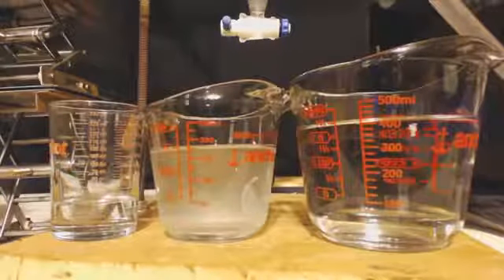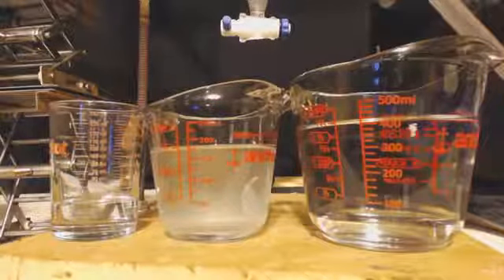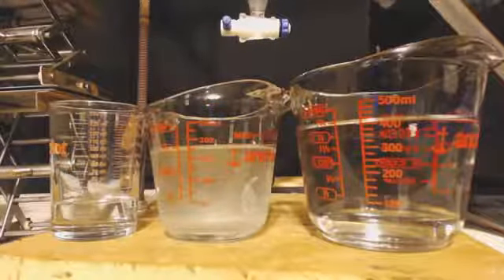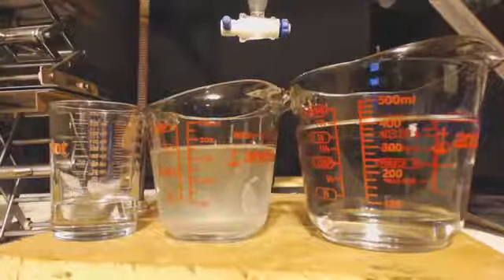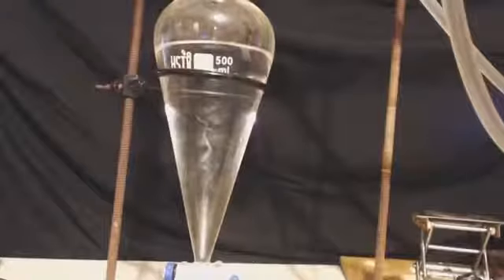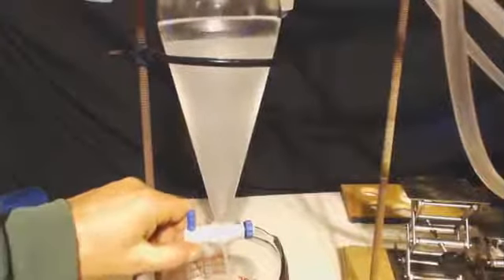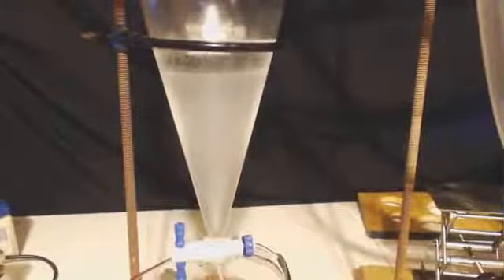So I'm basically going to do the same thing I did at the beginning. I'm going to put that in a separatory funnel and get all that water or methanol out of there by throwing some water in. It'll form two layers. Here we go. I got the non-polar stuff. Dump some water in it. Shake it up. Let it sit 20-30 minutes. And the top layer will be the toluene. The bottom layer will be the methanol water. Get it out of there.